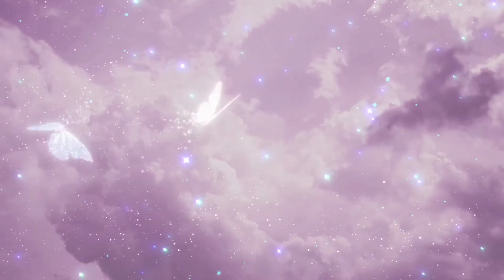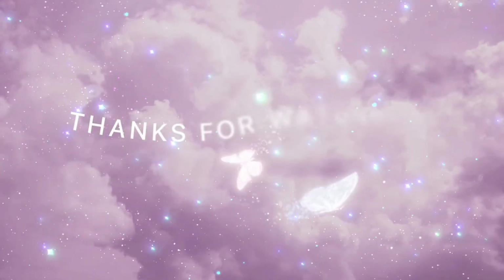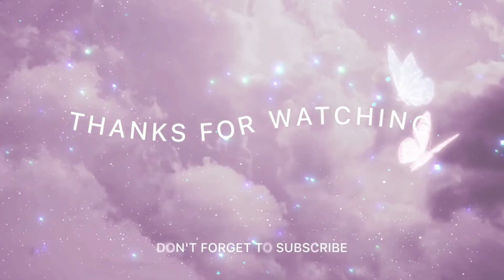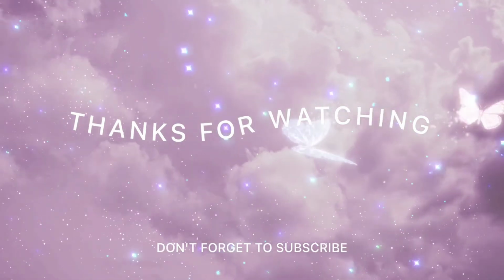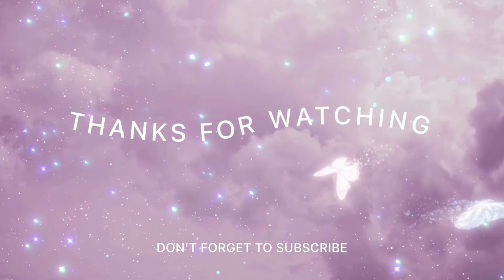And with that, we've reached the end of this tutorial, a complete step-by-step guide on creating an account on the Photon Center digital platform and submitting your analysis order. Remember, Photon Center, where precision becomes trust.